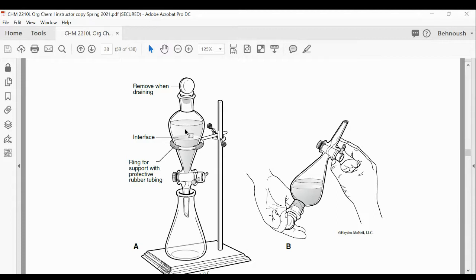If you have a mixture of two compounds, you dissolve that first in an organic layer, in an ether layer, because it's an organic compound. So you pick a solvent that would dissolve both of them. In this experiment, we are using ether. Ether would dissolve both compounds.